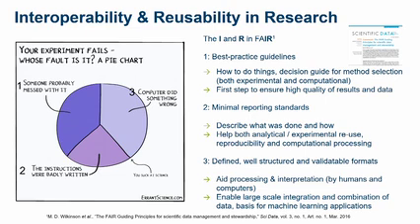Usually, if your experiment fails, whose fault is it? There are different possibilities. Someone probably messed with it, or someone didn't follow best practice guidelines on how to do things and how to ensure that everything is done in the right order, for example. The instructions were badly written, or someone didn't follow minimal reporting standards, so you cannot really reproduce or recreate the experiment that someone else did. But that also applies to data that has been stored somewhere, of course. If it hasn't been described in a way that you can actually use it, it's not really helpful.